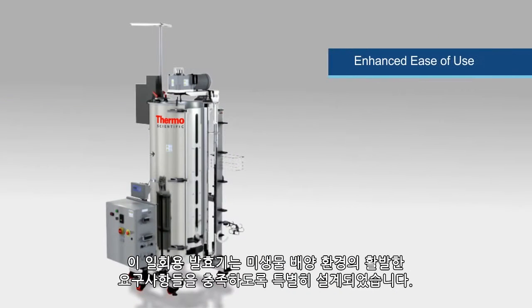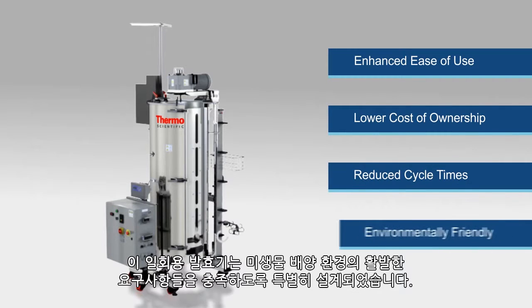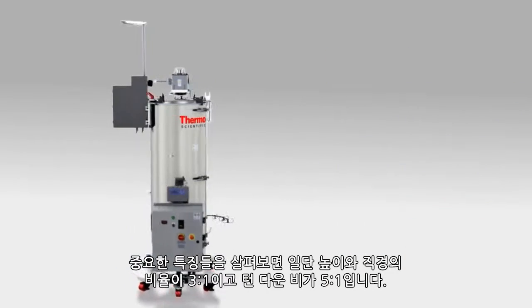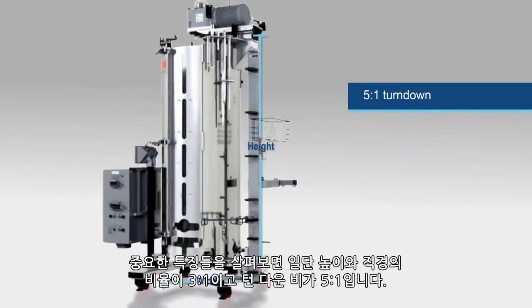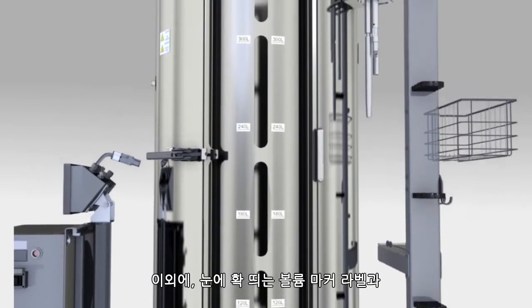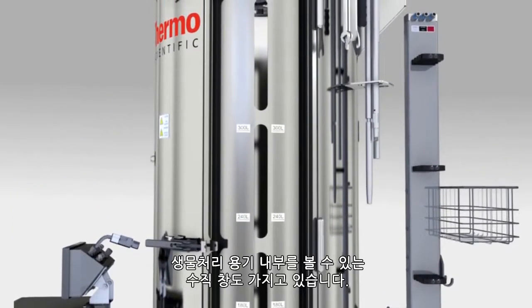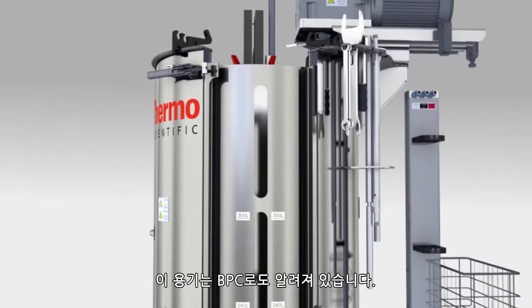The single-use fermenter has been specifically engineered to meet the vigorous requirements of microbial culture applications. Some of the key features include a 3-to-1 height-to-diameter ratio with a 5-to-1 turndown ratio, clearly visible volume marker labels, and a vertical window into the BioProcess container, also known as the BPC.